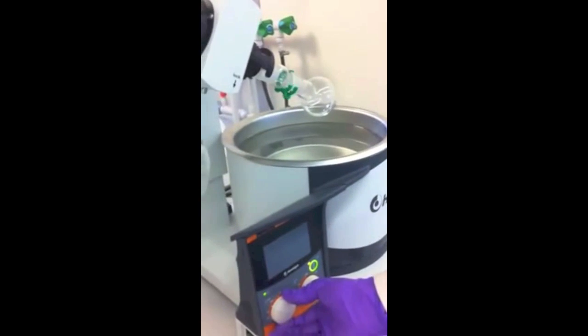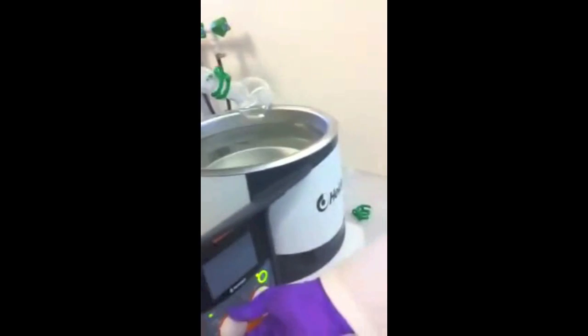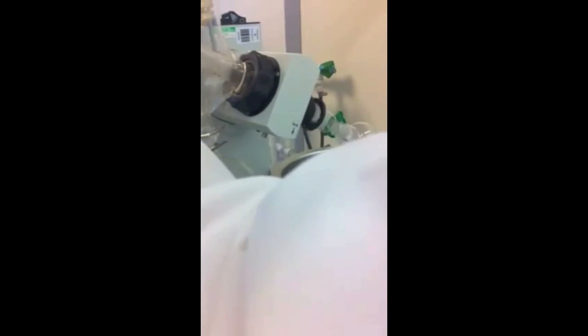Rotary evaporators are used to remove the solvent or reduce its volume. It does this by creating a vacuum, therefore reducing the pressure, and if necessary by heating the round bottom flask.